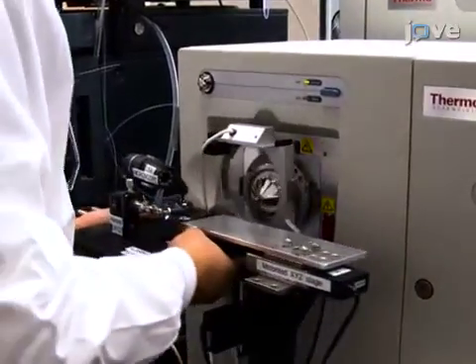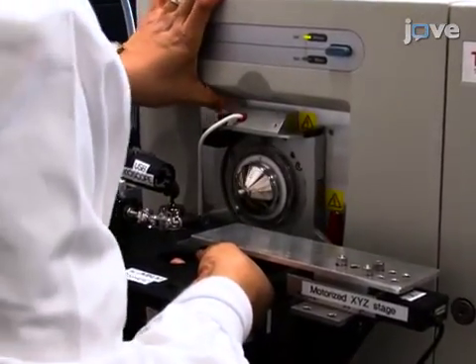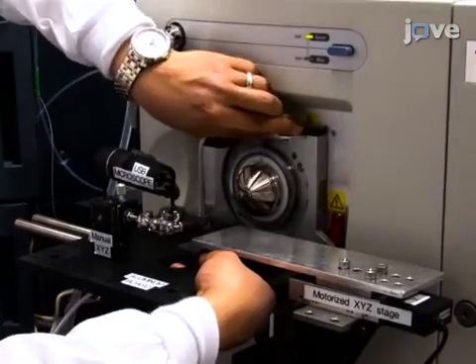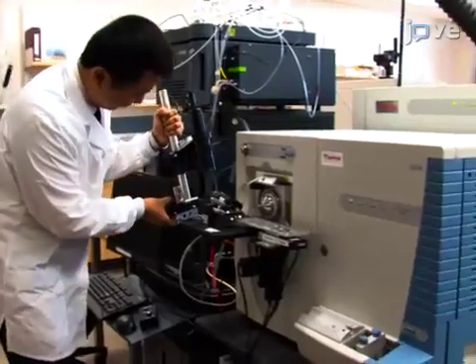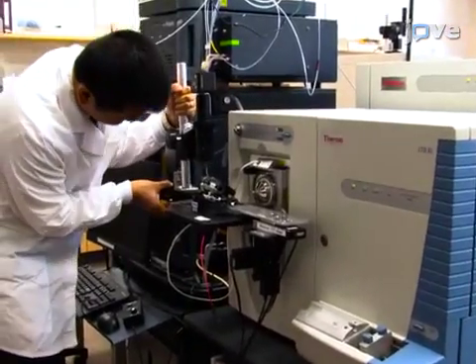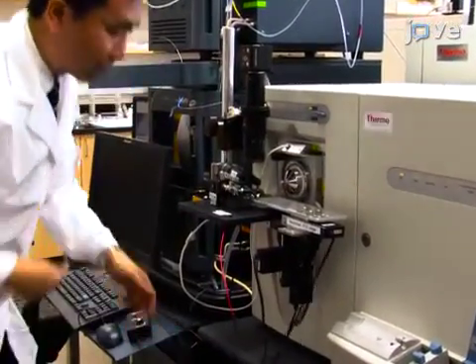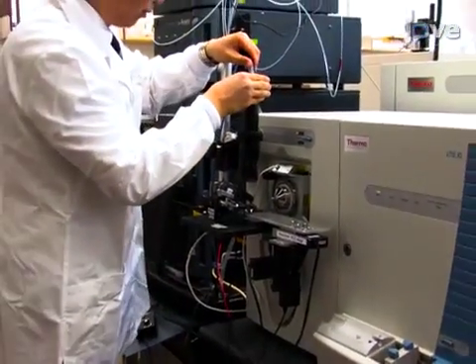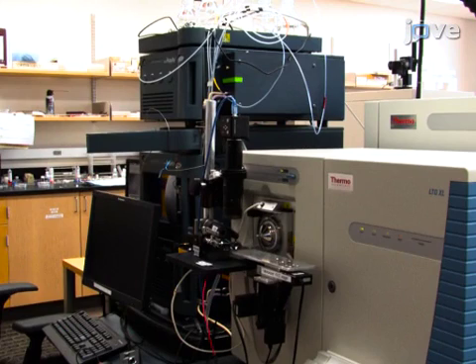This system includes a customized ion-source interface flange of the mass spectrometer and an aluminum optical board that is attached with a USB digital microscope, miniature manual XYZ translation stage, and the motorized XYZ translation stage system. Modify the ion-source interface flange of the mass spectrometer and fabricate the stand of the digital stereo microscope as described in the text protocol.